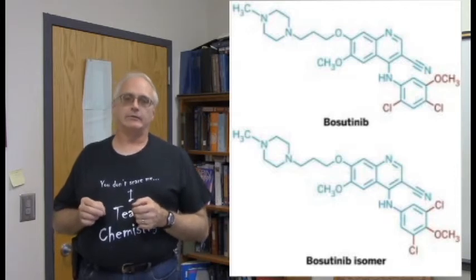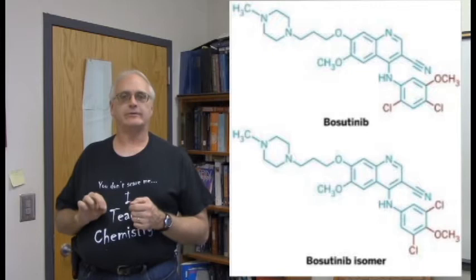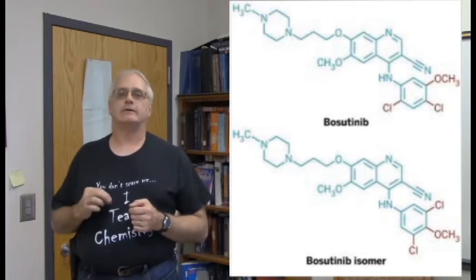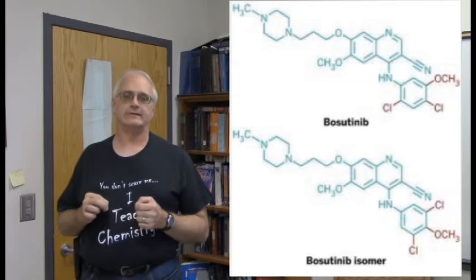And it is only in this one ring that they highlight here where in the isomer, the false material, that ring is symmetric. That would affect the number of peaks in a C13 spectrum compared to the actual molecule that people were interested in studying.